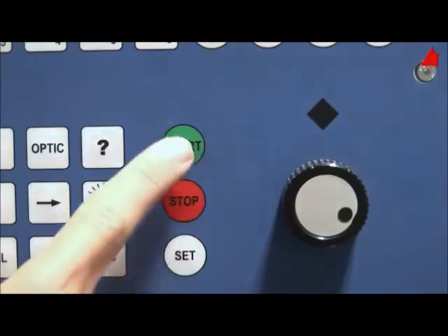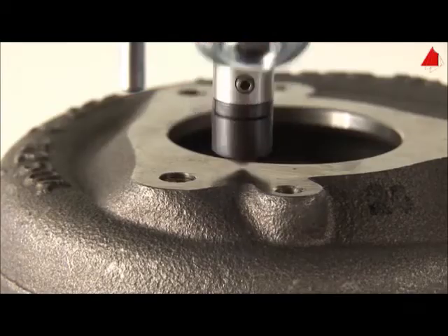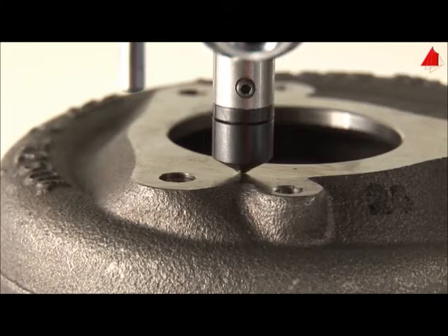By pushing the start button, the hardness test procedure begins. The testing machine rotates the lens back to its resting position and places the spherical indenter carefully on the test piece surface.